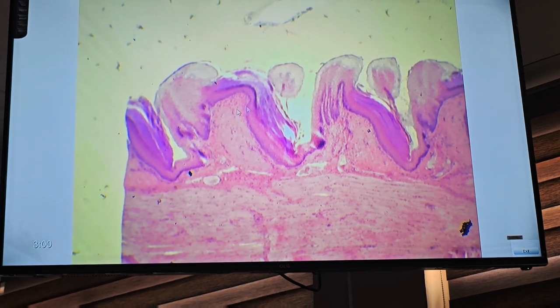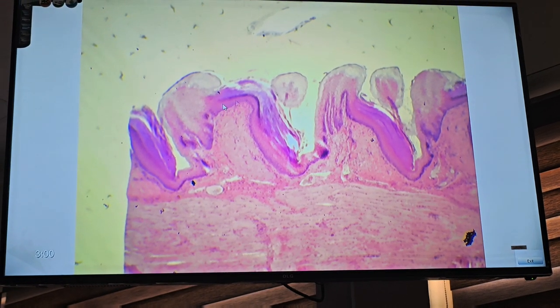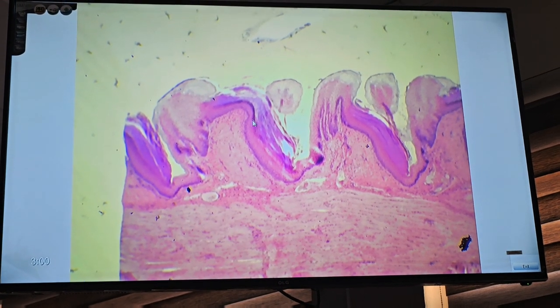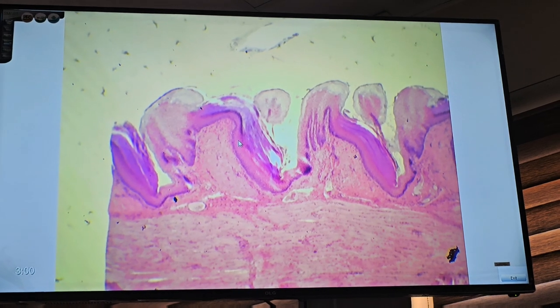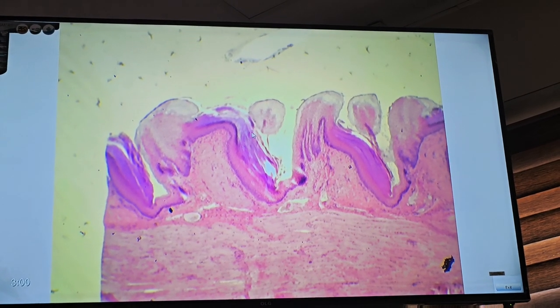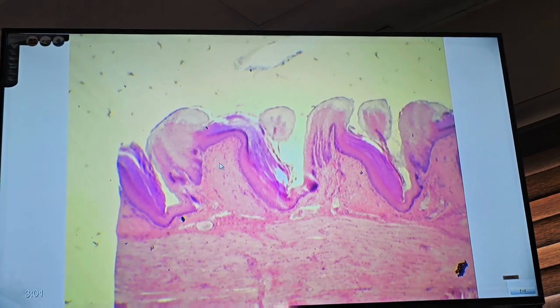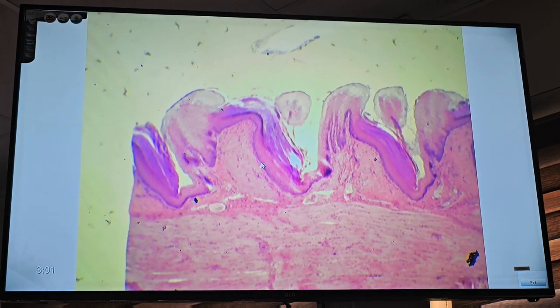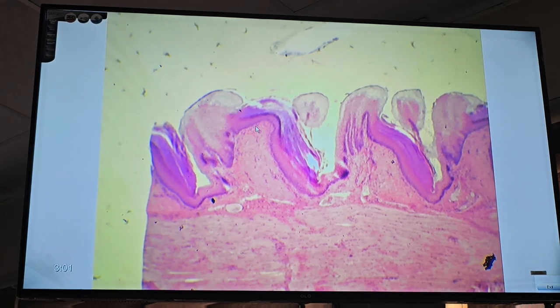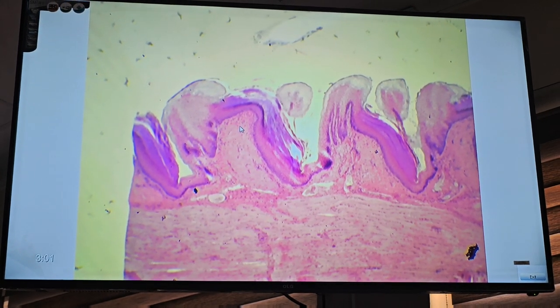It has a mushroom shape. We can see the dilated upper part. This type of papillae is lightly keratinized, with stratified squamous epithelium and lamina propria. Mushroom shaped. This type is much less numerous than filiform papillae.